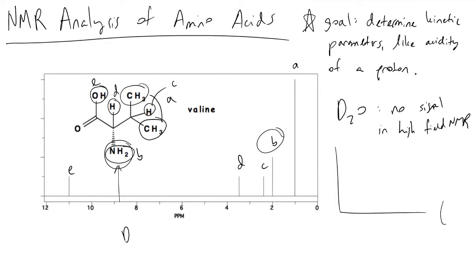And so if we plot a function with t on our x-axis and peak area of peak B, for instance, what we would find is that as we continually run our NMR spectra again and again over a certain time interval, we're going to find our peak area decreasing. That's not drawn too well, but we'll see something like this. And based on this curve, if we fit some kind of function to it, it would tell us the kinetic parameters of our protons on this amine.